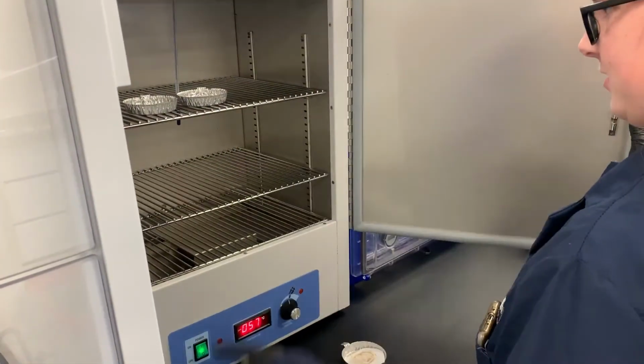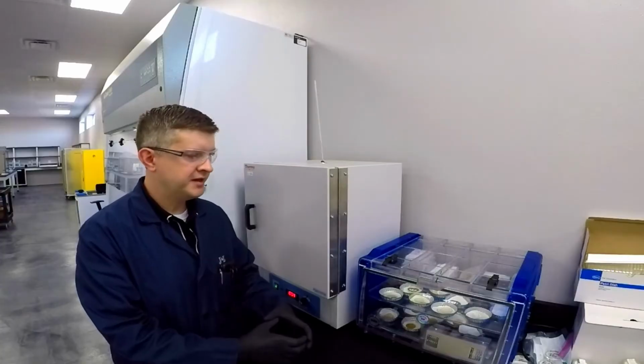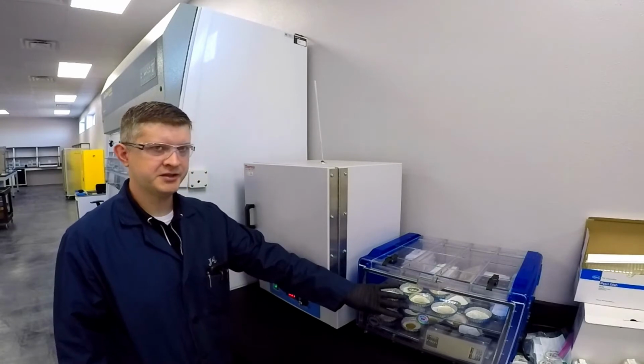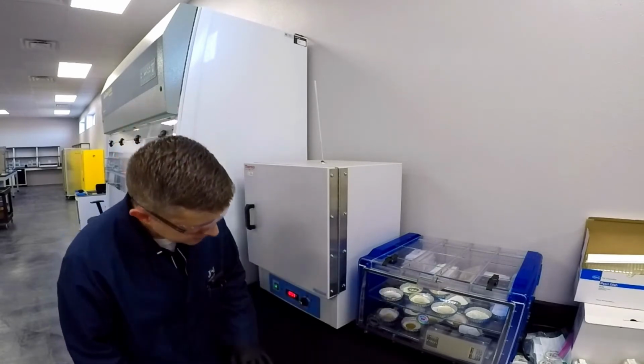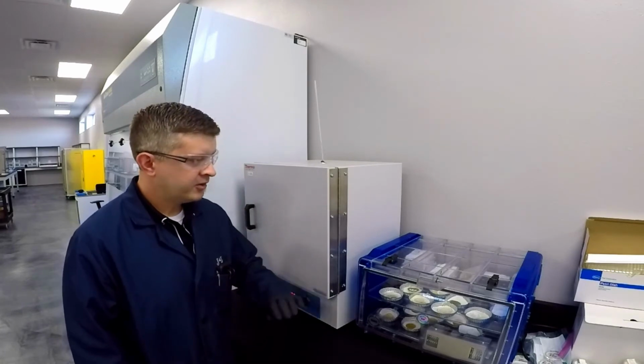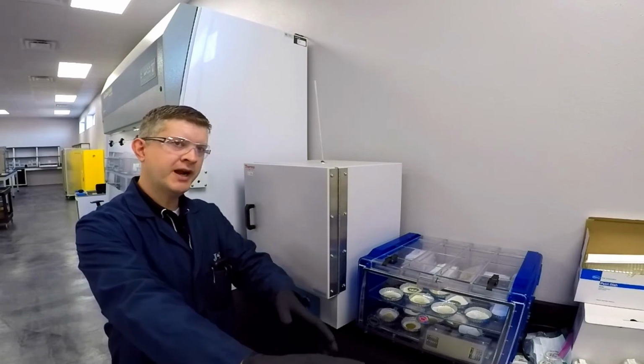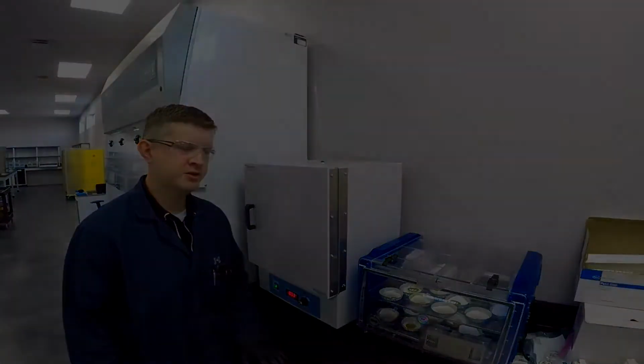And the NACE requirement for when the Millipore is coming to room temperature is that it does so under desiccation. So this is a desiccator where less than 10% relative humidity. We'll put it in here as it's coming to room temperature, and then we're going to proceed over to our analytical balance to do our measurement.